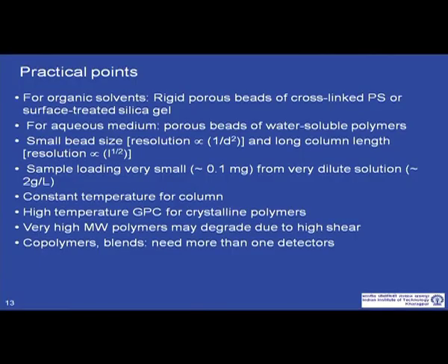Okay, before that let us go through a few practical points. For example, for organic solvents the beads are typically cross-linked polystyrene or surface treated silica gel, and for aqueous medium porous beads of cross-linked water soluble polymers are used.